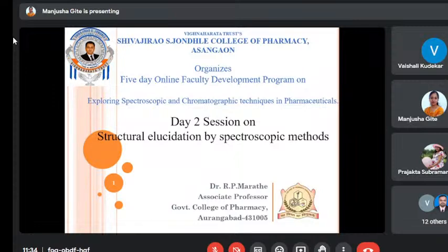What is meant by chromophore? What is meant by absorption? What is meant by hyperchromic effect, hypochromic effect, transition state? The applications you mentioned are fine up to B.Pharm level. But listen carefully to UV visible spectroscopy, and note it down if needed. UV visible spectroscopy is mainly used to determine lambda max of conjugated dienes, trienes, alpha beta unsaturated ketones.